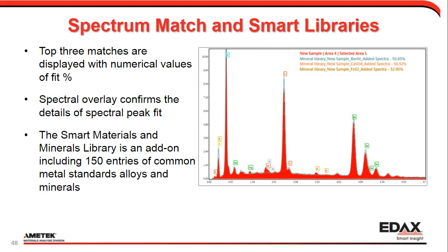The top three matches are displayed with numerical values of fit percentage. Spectral overlay confirms the details of the spectral peak fit.